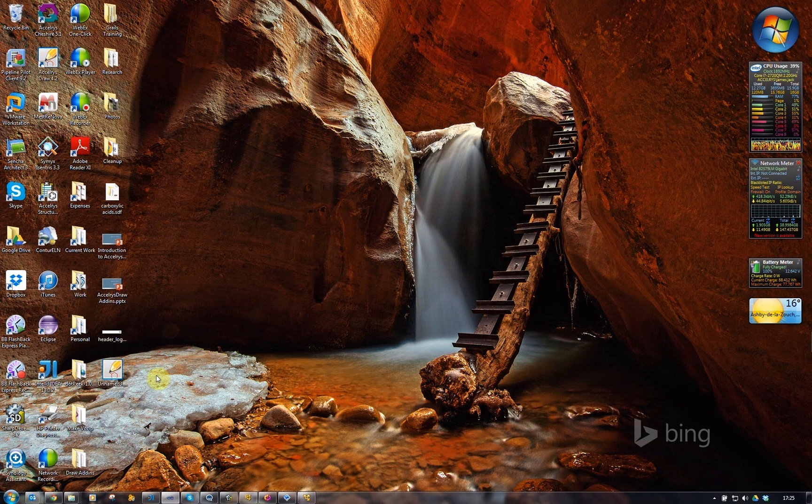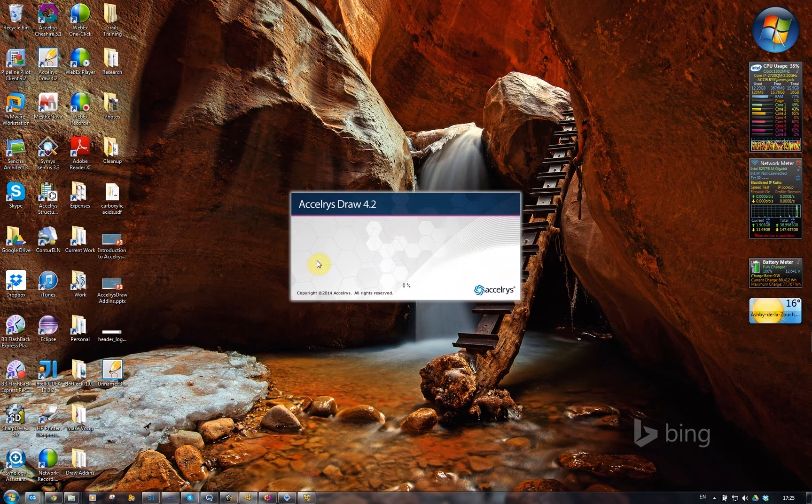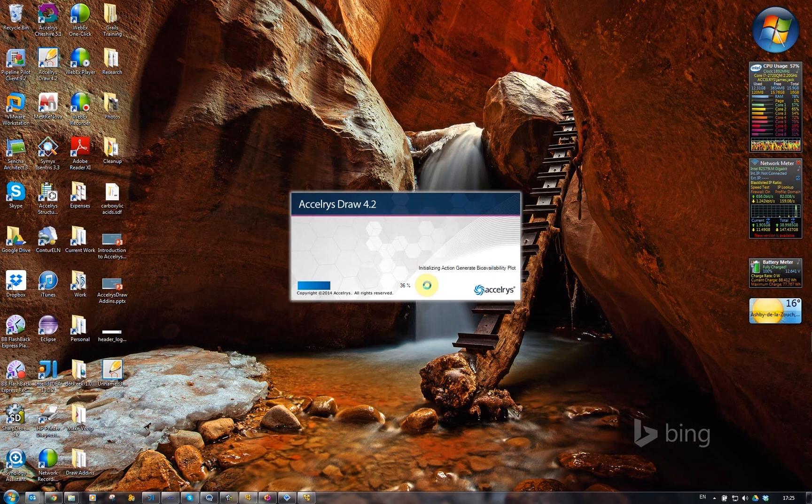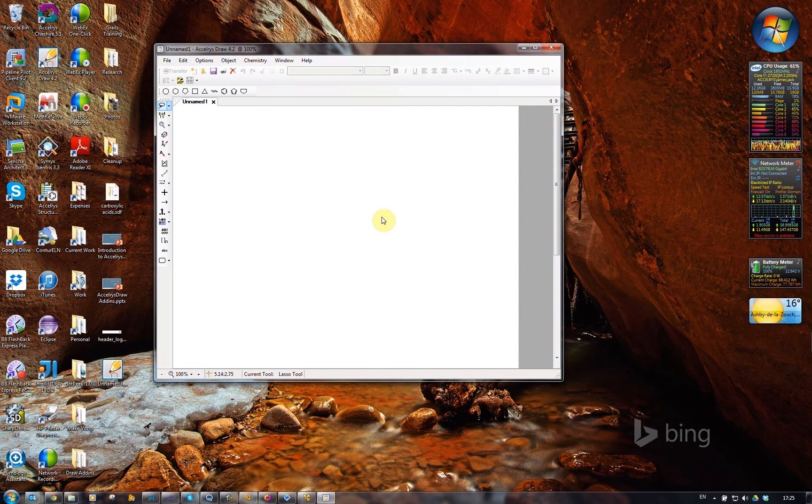Hi, it's James from Biovia, formerly Accelerys. I was asked by one of the users of my draw add-ins to do a quick tutorial demo of some of the reaction tools.